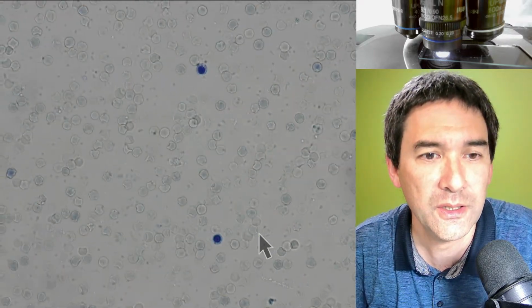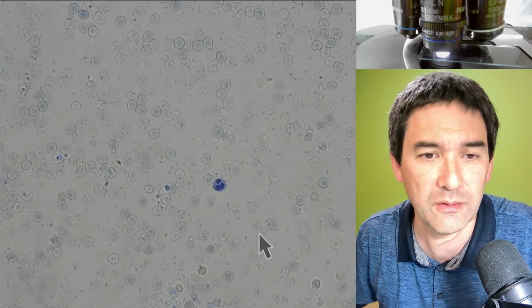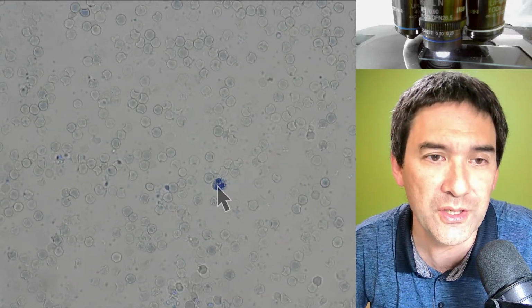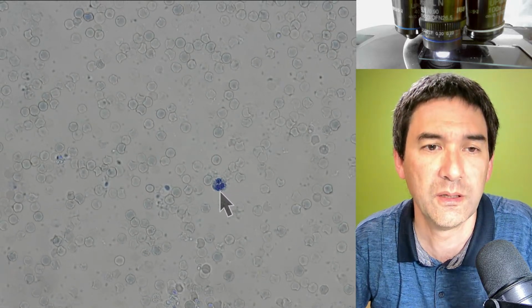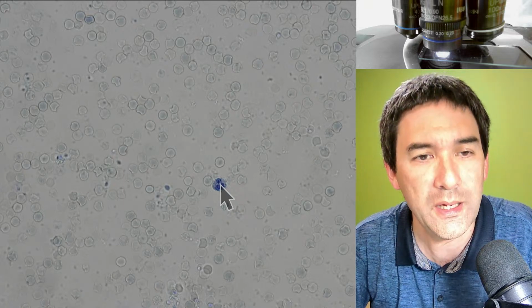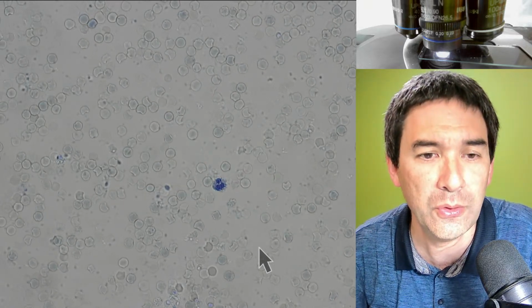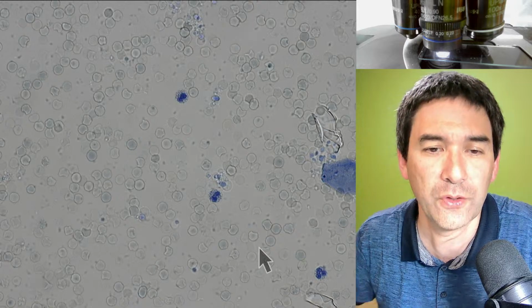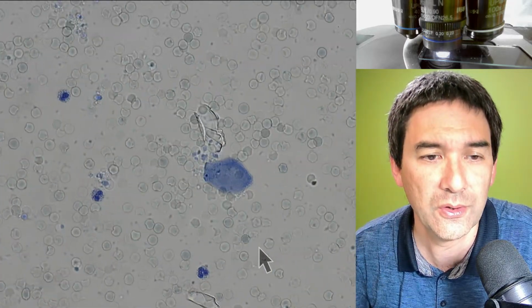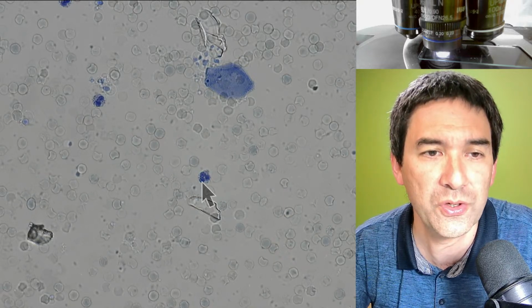And here again, you see that making those white blood cells visible is actually fairly easy. Here you see also that the nuclei of the white blood cells have different lobes. The reason why methylene blue stains the nucleus is because methylene blue has an affinity to DNA. It likes to stick to the DNA. And here, for example, in the corner down here, you see that this one over here seems to have 3 lobes. 1, 2, 3.